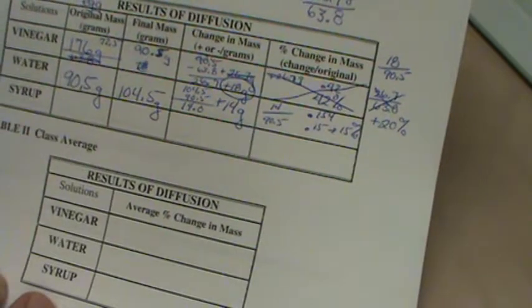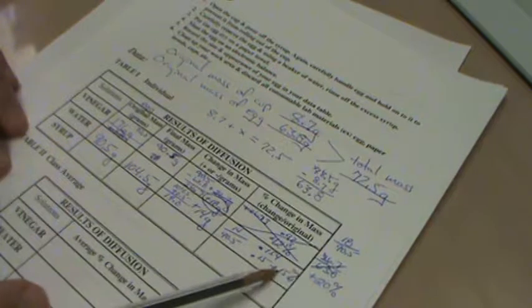And when I see papers like this, it tells me students are working. I have absolutely no problem with that. So for today, we've still increased. We've had a total of about a 35% increase over the beginning mass at 72.5.